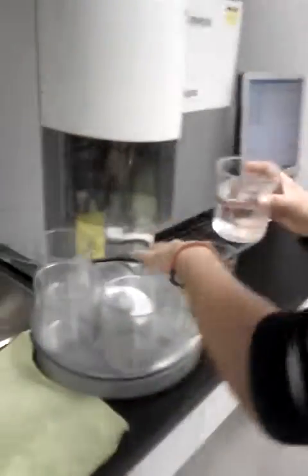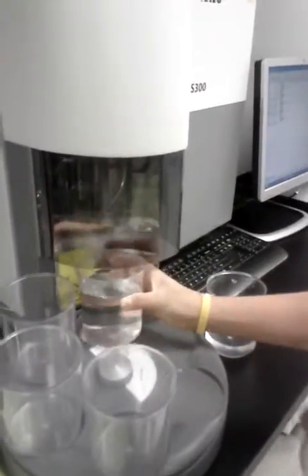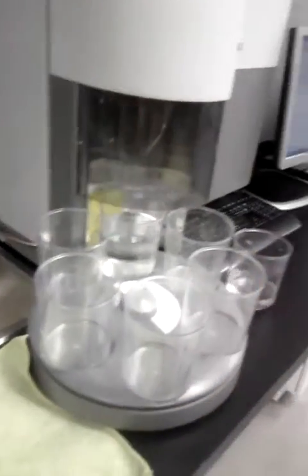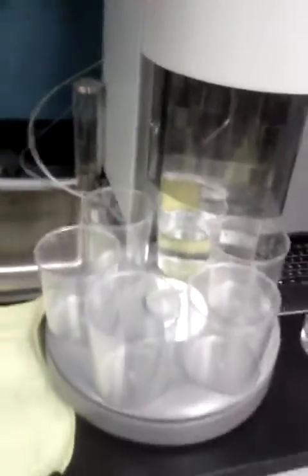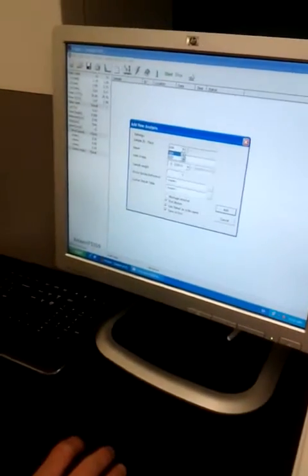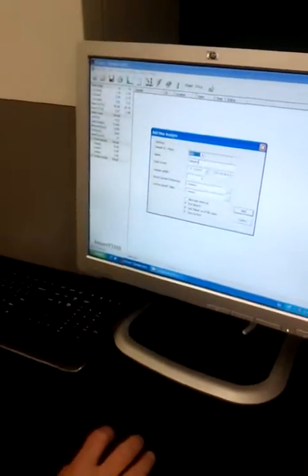Like that. Alright. You enter. Let me see. What is this one? So my deposit file is number 5.